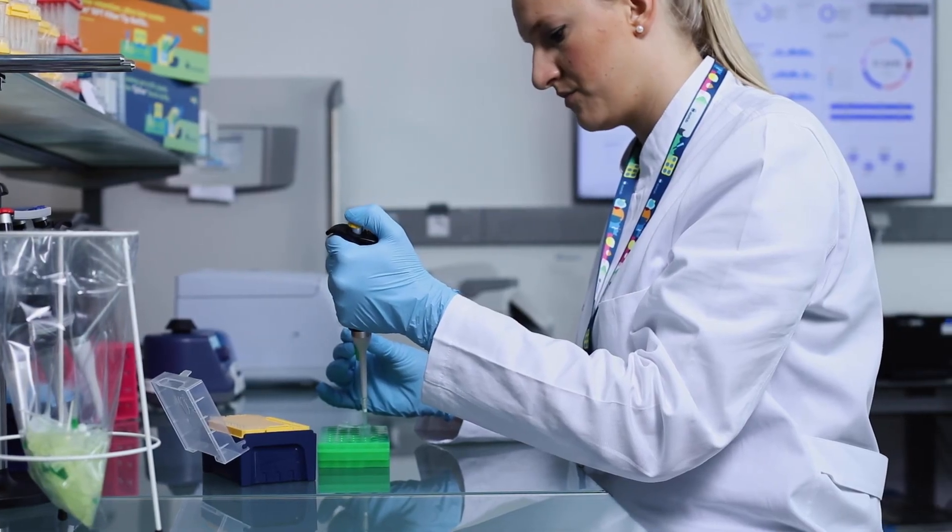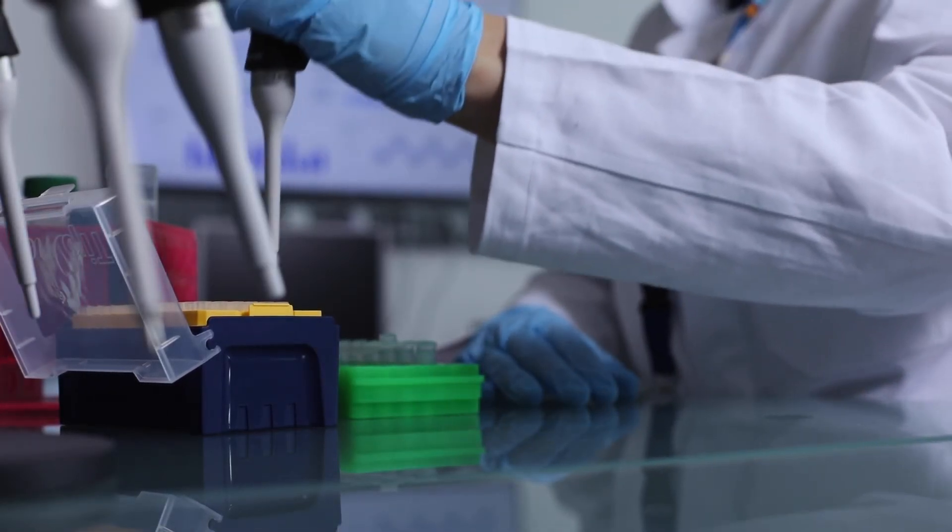Wet, wet, wet that tip before dispensing your sample.